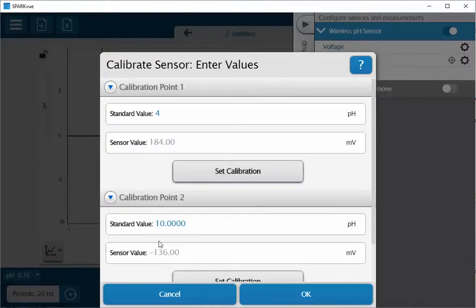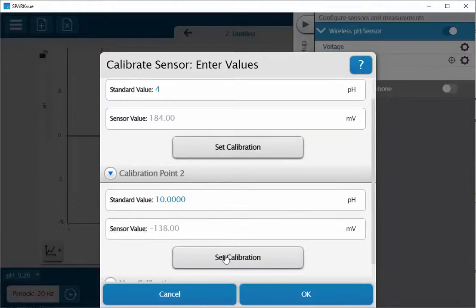Again, this is the value in millivolts that's being read directly. I'll wait for it to stabilize and once that's happened we'll go ahead and scroll on down and hit set calibration and I'll click OK.